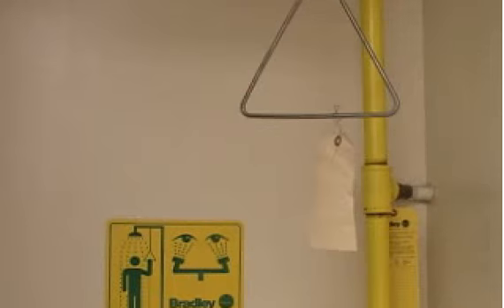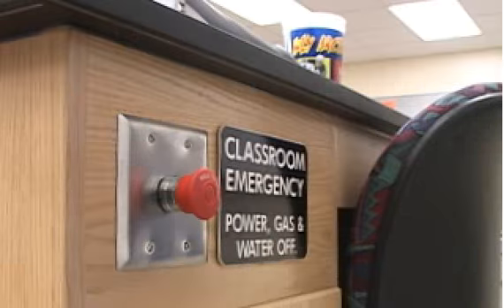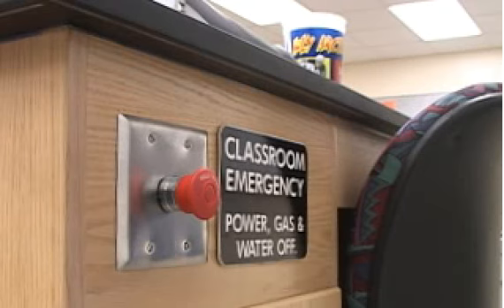And then to the right of the fume hoods in the back, there's a safety shower and also an eye wash station, which you won't need to use because you'll have your goggles on. There is an emergency shut-off switch in case there was anything that were to happen. This is primarily for the teachers to use, but it is located at the teacher's desk. It's a red button. In case we needed to cut gas or power very quickly, that would be the switch to do that.